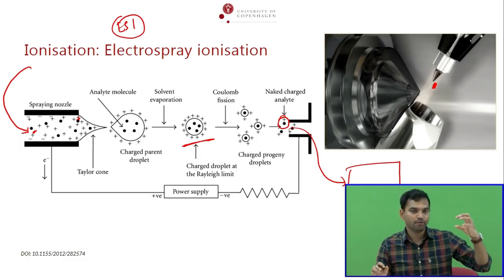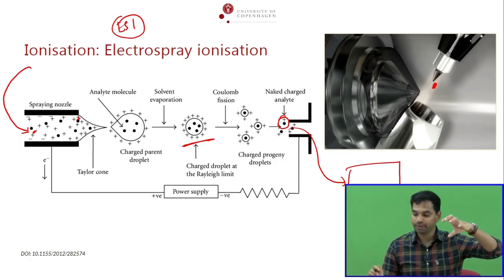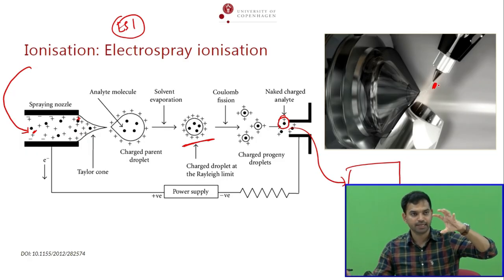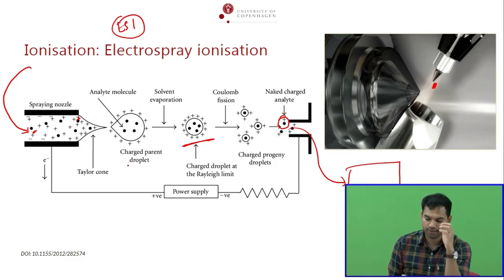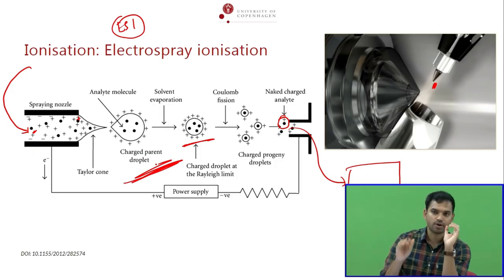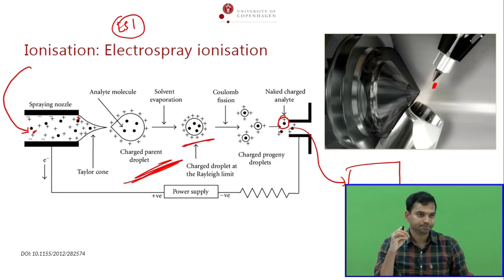So basically, you have an ion. In the liquid chromatography, you have a liquid, okay? The liquid is mixed with gas, and you actually spray them, and then there will be formation of the bubbles with charge. I won't go into detail about all these things, don't worry. Just remember that you get the ions with the charge.